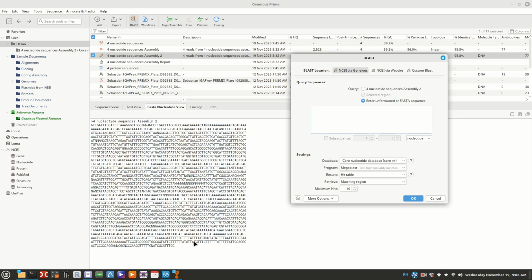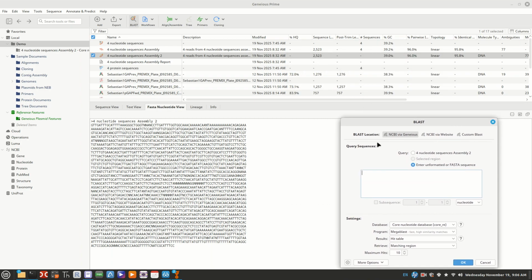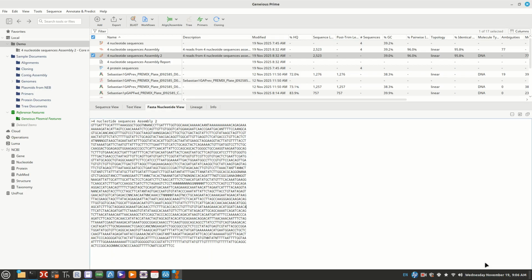Now, I know what it's going to get when we do this. So we can cut and paste this right here. This is our FASTA file. So let me do that real quick. Oh, I have to cancel this. Okay, so I'm just going to do it the easy way, which is here, and then I can go Control C, and that will copy it.